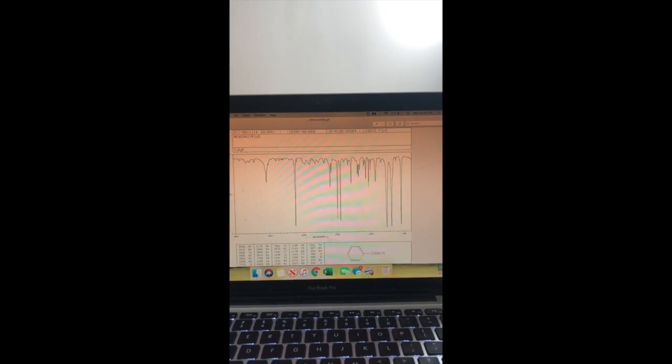You're going to have the aryl overtones at around 2000. Your sp2 CH stretches at roughly 3100, which again are going to be reduced because of conjugation. And yeah, that's essentially all. Those are all the major peaks that you will see in IR.